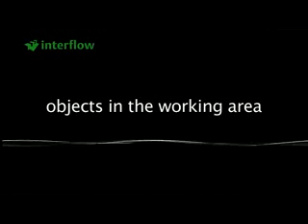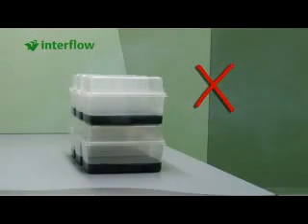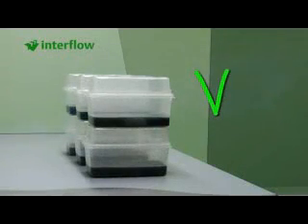How do I deal in a correct way with objects in the working area? Never put objects against each other, as this obstructs the air flow. Keep at least 2 cm distance between the objects — the air flow is then obstructed as little as possible.